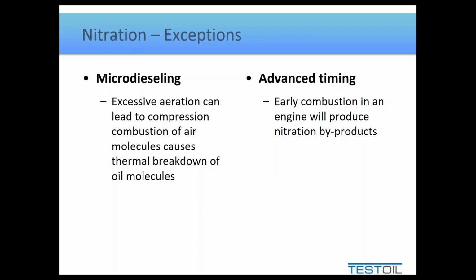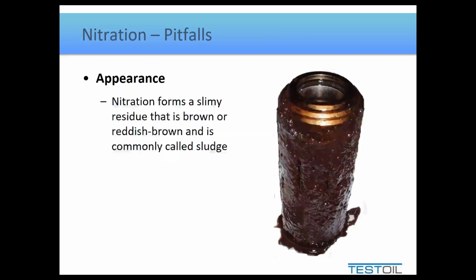So nitration is one of those things that we don't like to see because it indicates something not right happening within the system. Oxidation, typically you're going to get no matter what, so we don't get too excited by the simple presence of it, but nitration tends to indicate a worse occurrence. Now the pitfall with nitration is most folks don't know what nitration looks like either. Nitration is the stuff that we would call slimy or slippery.